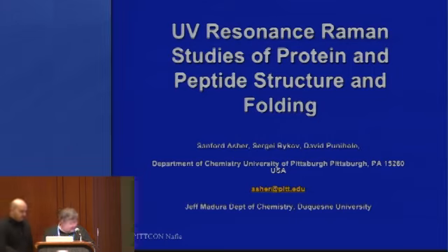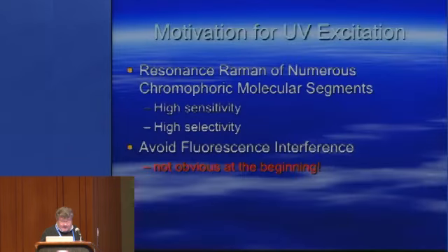Now, if I could have some photons with the laser, look at that, then I could tell you about some recent work in the UV spectral region to excite the Raman spectra of vibrational modes of chromophoric molecules, or molecular segments in the case of proteins. And this is a story of looking at molecular segments in order to interrogate their structure and function and dynamics.